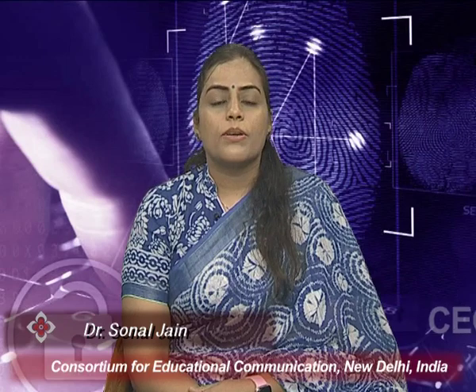In this series of forensic science lectures, today we are going to discuss different types of centrifugation techniques. When we talk about centrifugation techniques, they are based upon what kind of evidence you have found at the crime scene and what you want to extract out of it. Either we have to separate, or we have to purify certain substances, or we are looking for certain specific types of cell. So, depending upon that, we use different kinds of centrifugation techniques.